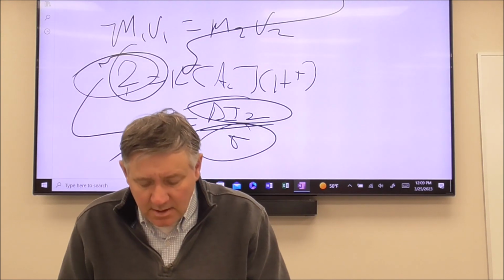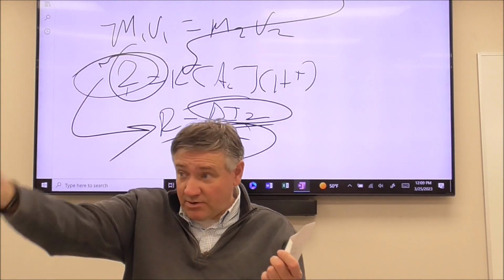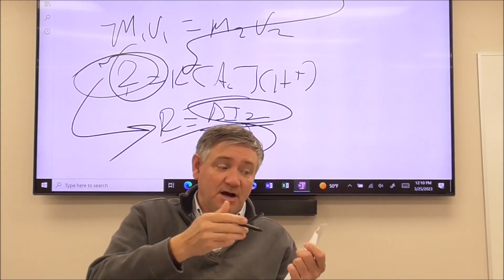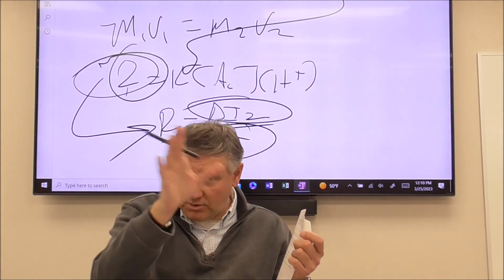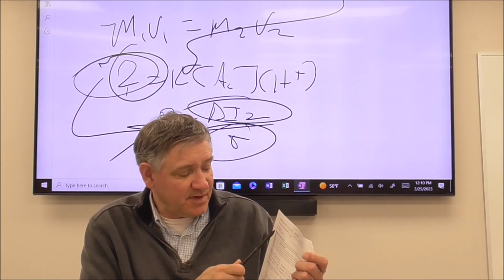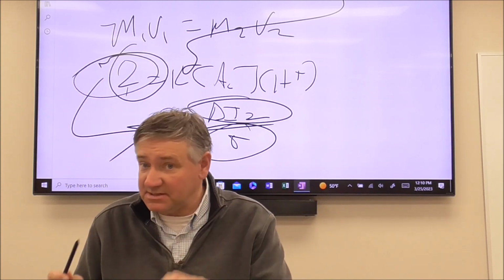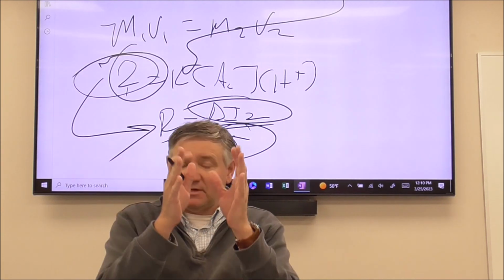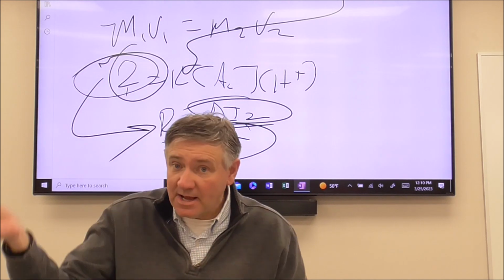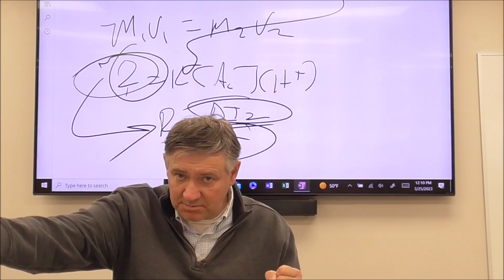Okay. Then it says, teacher signature, Ms. Calhoun, you're going to sign off on this. Go up to them, have the kids sign off on it, and make sure that you're seeing these calculations. And then you're going to run the reaction, and you're going to see how close your reaction happens. And it's the exact same process. Mix together the water, the acetone, and the hydrochloric acid. Add the iodine, start your stopwatches, observe what happens.